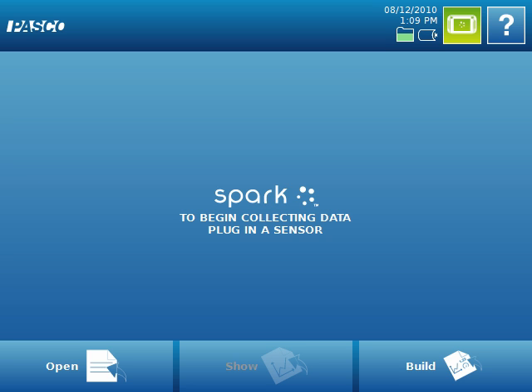In this demonstration, we will be looking at the screen on a Spark Science Learning System, but because the labs are virtually the same within SparkView as they are on the Spark Science Learning System, you can still follow along using SparkView, and I'll be sure to point out any differences along the way.